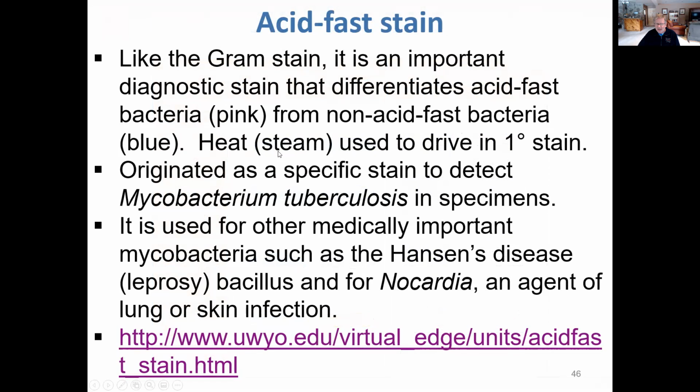Another very interesting aspect of the procedure of this stain is the implementation of steam or heat to help drive in the primary stain, because usually the cell wall of these acid-fast bacteria is very waxy. And so to help push the primary stain in, we usually use a little steam bath, and we steam our heat-fixed slides over the steam for several minutes to help drive that primary stain in. So more on that coming up later.